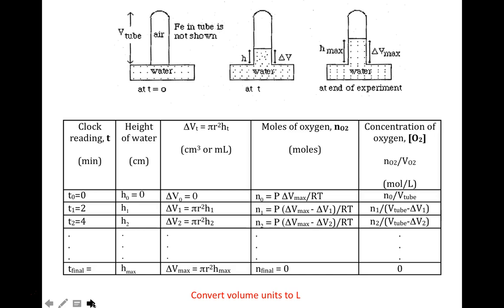So when you are making an Excel file, make sure you're paying attention to when you're creating these equations that they actually make sense. Because we've seen before, if you write one equation and try to pull it down, some things need to remain constant, and if you don't use those dollar signs in front of the cell number and the cell letter, it can mess everything up. So just make sure you're paying attention to the equations that you write in Excel, right?